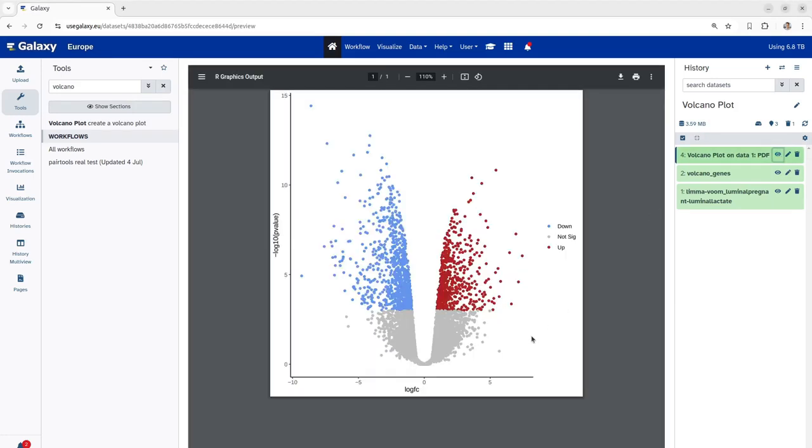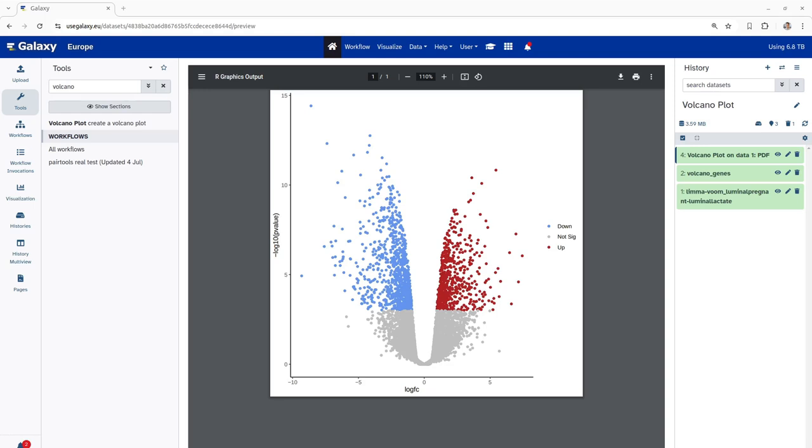So, this is the volcano plot based on our specified data. In this plot, the genes are colored if they pass the specified threshold for the FDR and log fold change. The red color is denoted if the genes are upregulated, whereas the blue color denotes if the genes are downregulated. Based on this volcano plot, you can clearly see that there are many significant genes in this dataset.